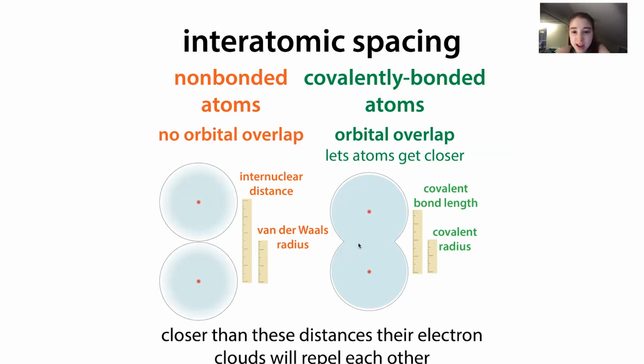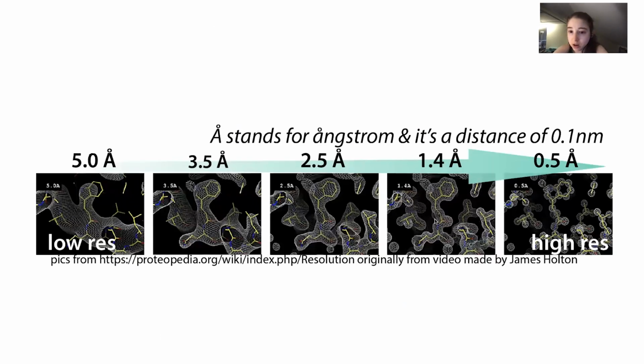And so with hydrogen, we have a really small atom, and so those bonds are going to be shorter. Hydrogen-carbon bonds are about 1.1-ish angstrom. Carbon-carbon bonds, because those carbons are bigger, you're going to be getting closer to like 1.5-ish. And so when we talk about atomic resolution structures, typically we're referring to around 1.2, where we can make out all the individual atoms.